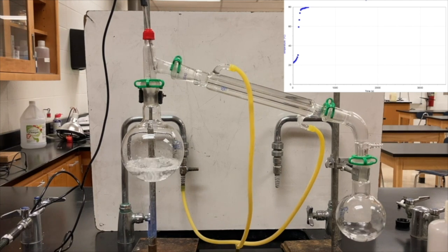Back to normal speed. You can see that there's a liquid dripping now into the cold end of the apparatus, and that liquid should be whatever boils at the lower temperature of this mixture. So the mixture is boiling. The vapor is going up into that little Y-shaped piece. It's being forced down the condenser because there's no place else to go, and then it condenses and shows up as liquid on the other side.